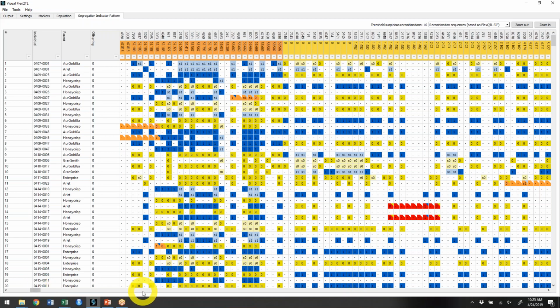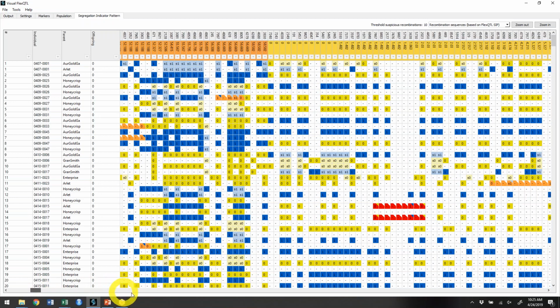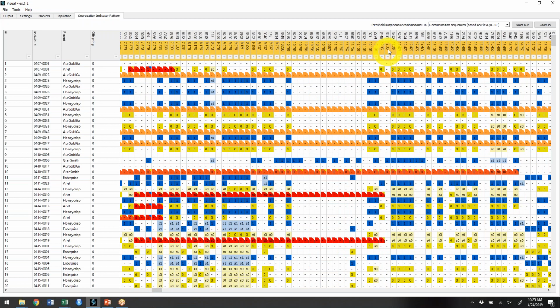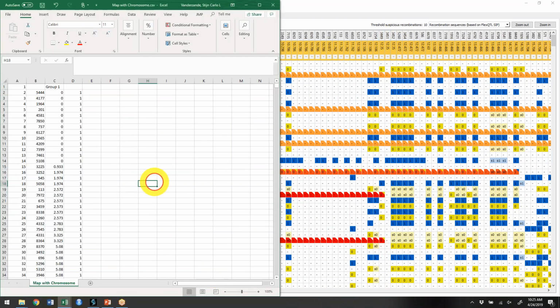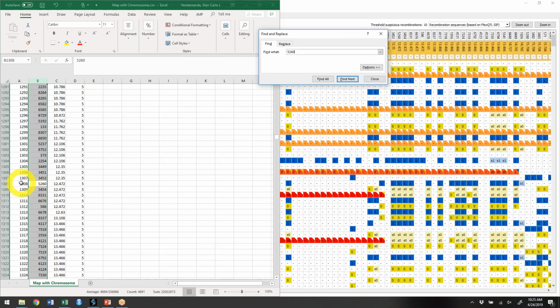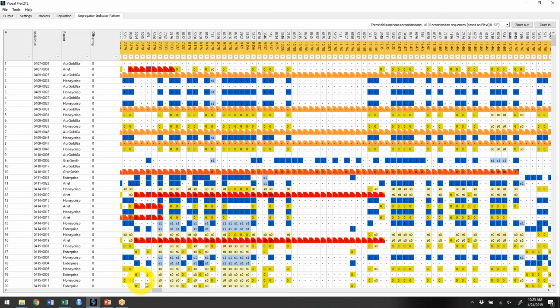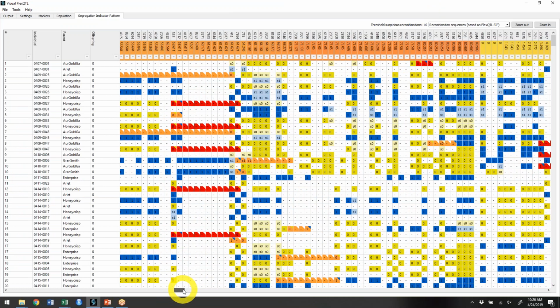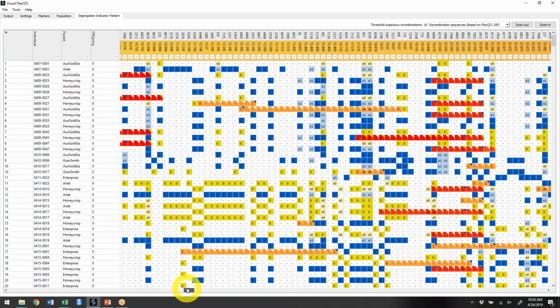So what I mostly do is I make an educated guess of where it is. Chromosome 6 is about 1/3 of all the chromosomes, so that would be somewhere here, let's say. And then I look just at any marker, let's take marker 5260, and I go to my map, 5260, and I only want marker names, and this is on chromosome 5. So I need to move over one more chromosome, but especially for the middle ones, that is faster than slowly sliding till you're where you want to be.